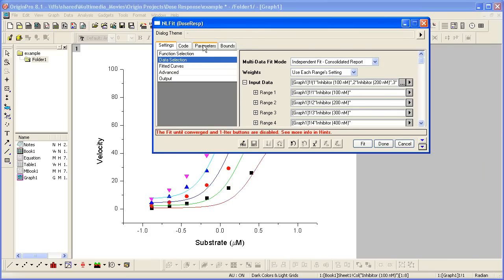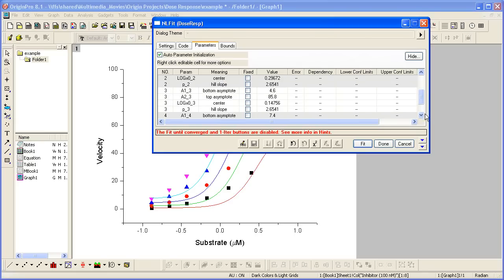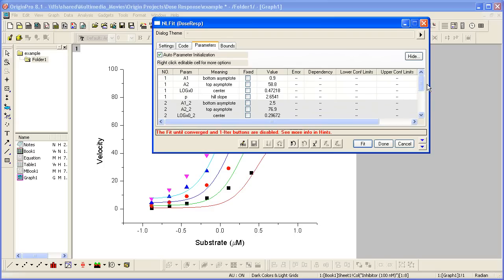Let's look at the parameters tab. And you'll see there are four sets of parameters. Now, I want to share the A1 and A2 parameters.